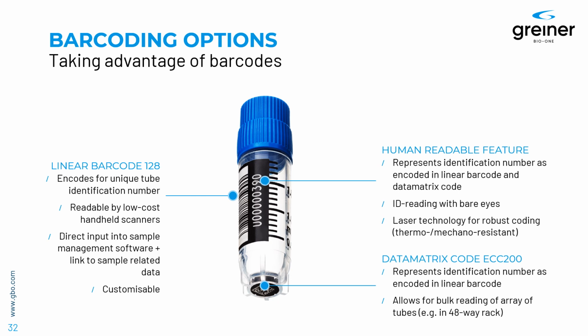But there's also a representation in form of a linear barcode. Here you can use a low-cost barcode scanner to retrieve the information. It's the same ID, and you just introduce it into an Excel spreadsheet or any kind of software with a very low-cost option and without the risk of any human-introduced error.